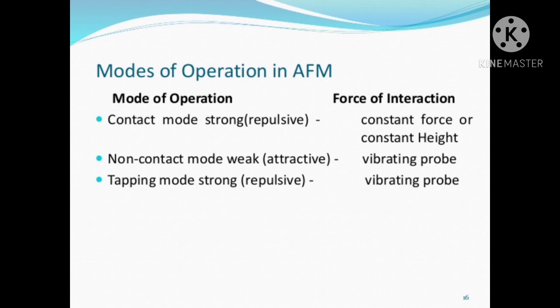The force of interaction in contact mode is constant and high, in non-contact mode it is a vibrating probe, and in tapping mode it is also a vibrating probe.